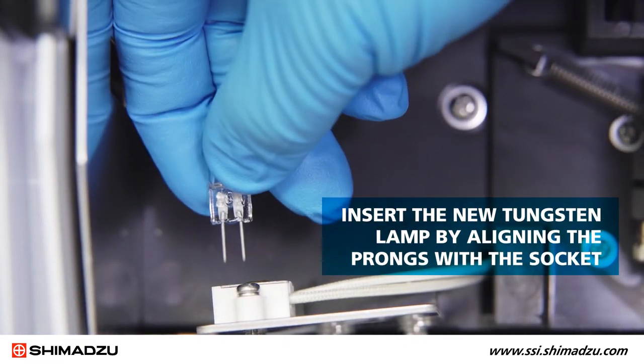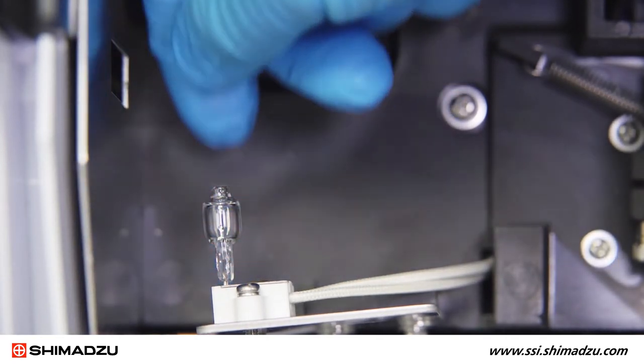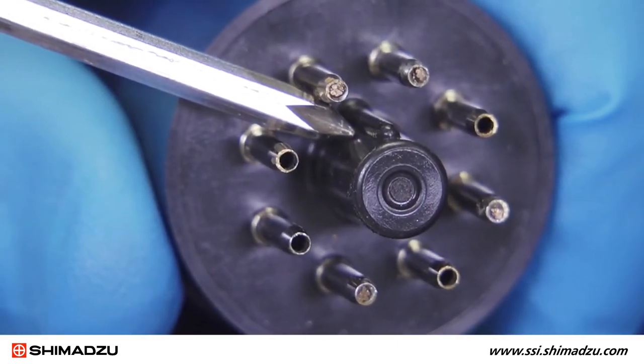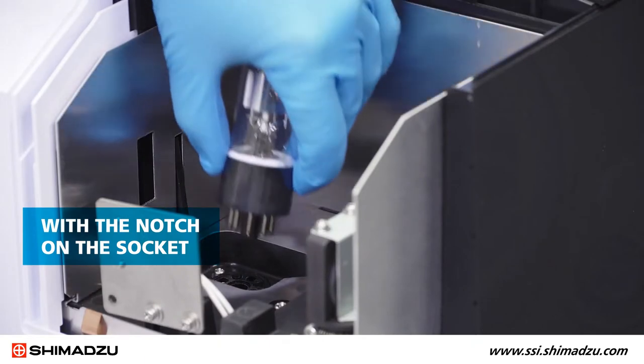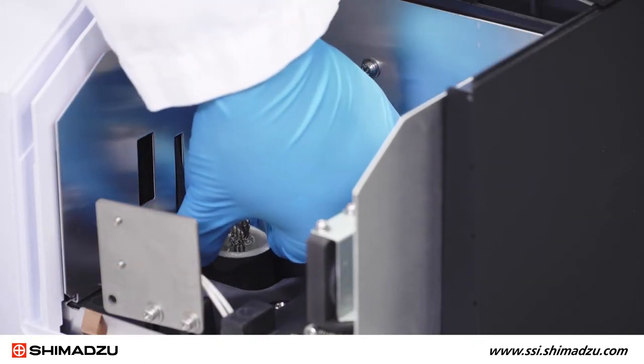Insert the new tungsten lamp by aligning the prongs with the socket and pressing firmly. The lamp can be installed either way. To insert the new deuterium lamp, match the alignment pin on the lamp with the notch on the socket and firmly insert the lamp. It should sit flat against the lamp compartment.